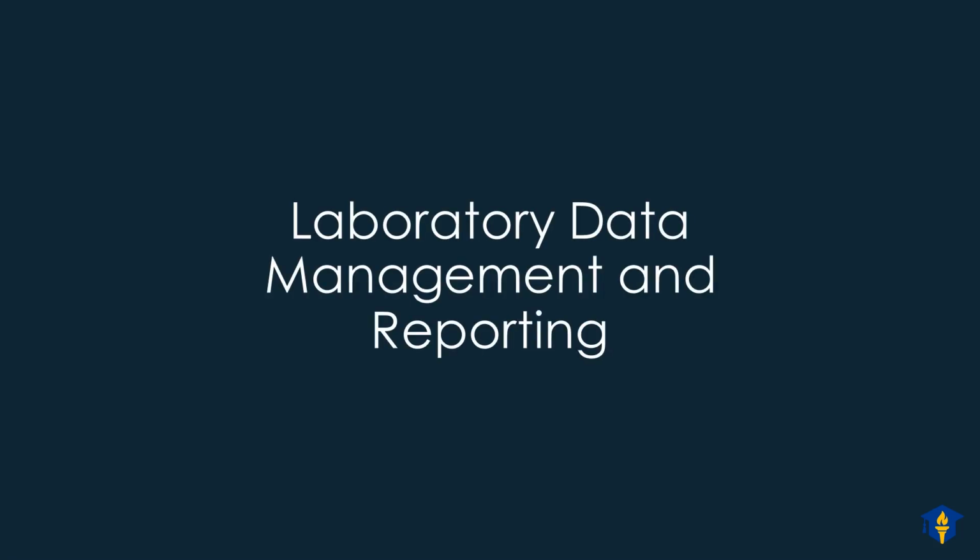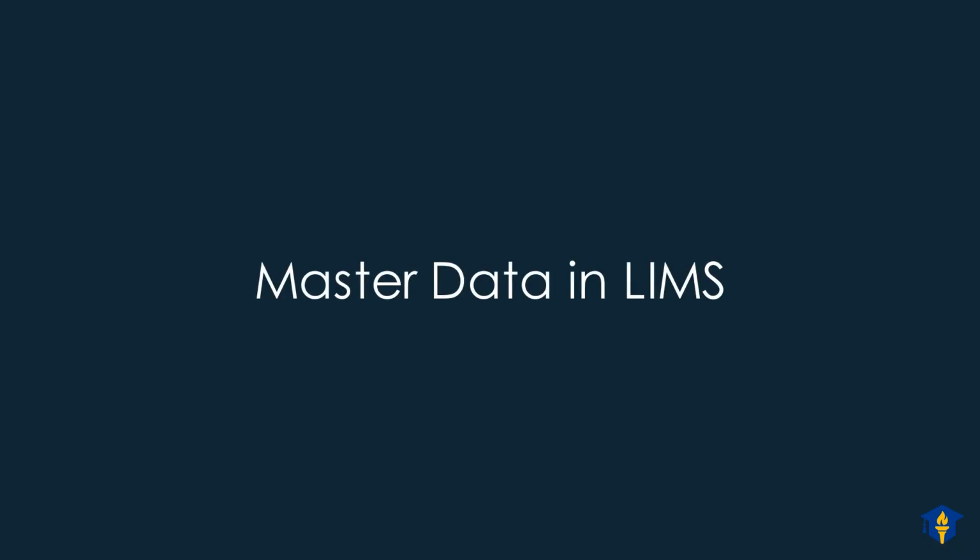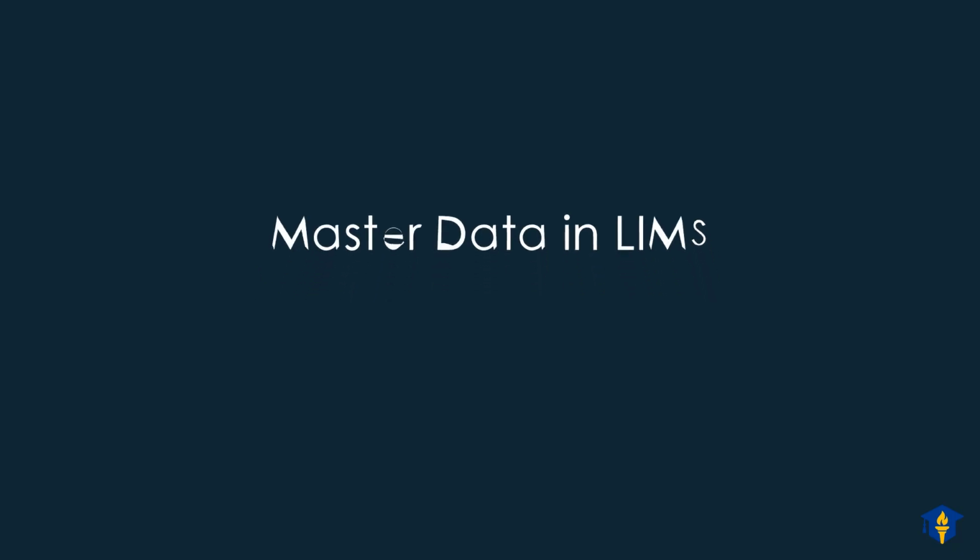Welcome to our module on laboratory data management and reporting, a crucial aspect of modern lab operations. We will explore how to ensure the integrity, security, and transformation of data into actionable insights effectively. Today, we will focus on understanding master data within a laboratory information management system or LIMS.